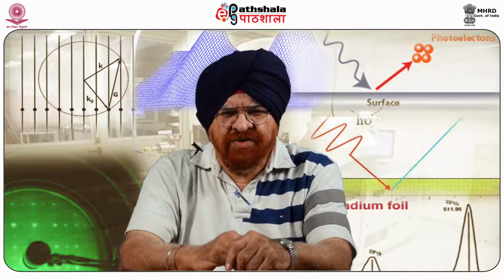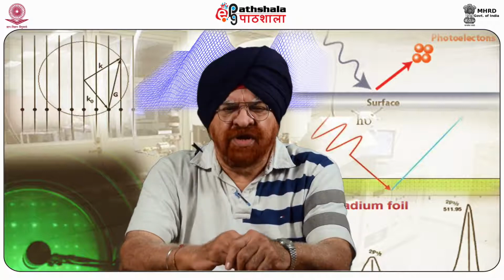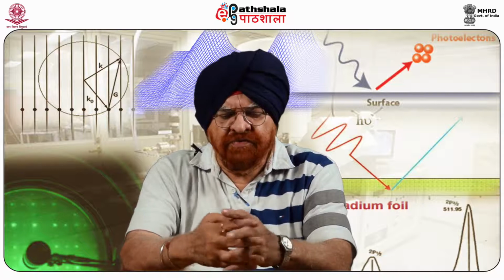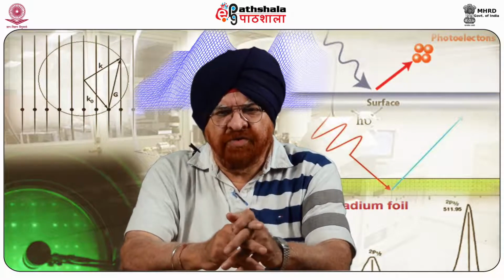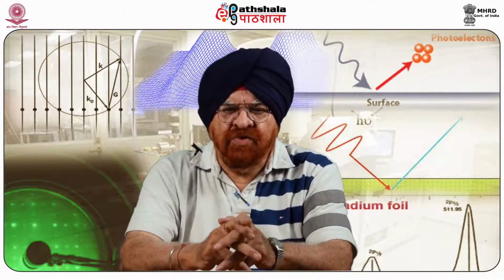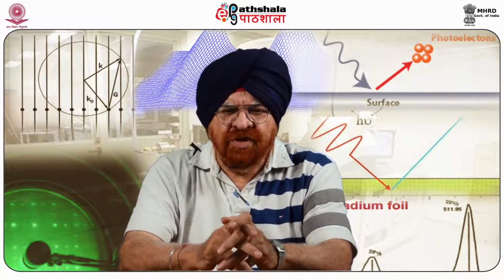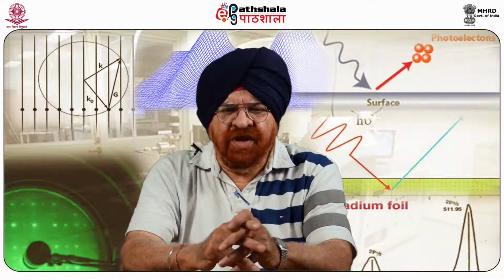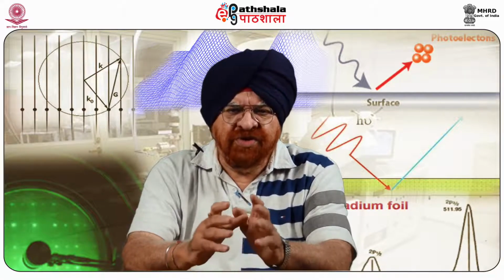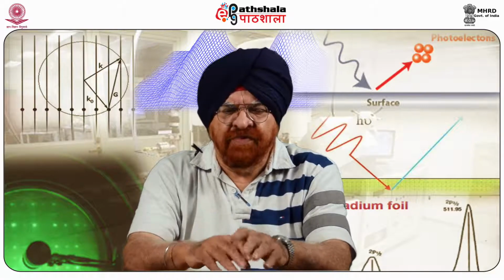After explaining the importance of surface analytical techniques by using different techniques depending upon what energy value they are using, we have now come to discuss another module, which will deal with Kelvin probe force microscopy, abbreviated as KPFM.